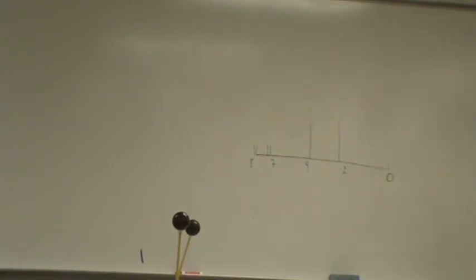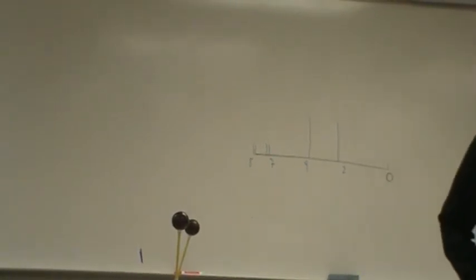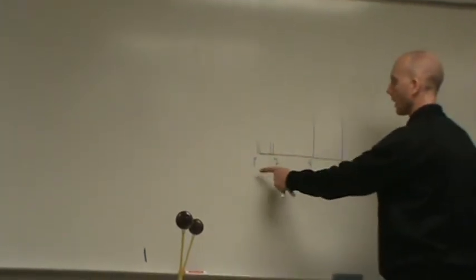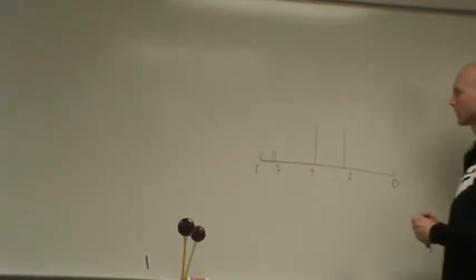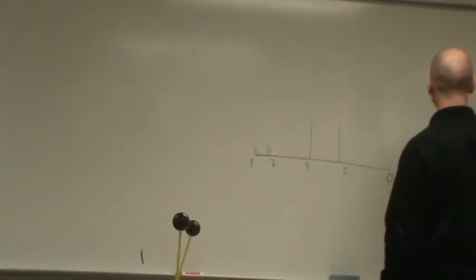So, based on this sketch, is there anything that I might be able to draw? Yeah. Okay, what did we just go over? Anything between 7 and 8, we have a benzene ring. Okay? So let's just go ahead and draw that benzene ring.